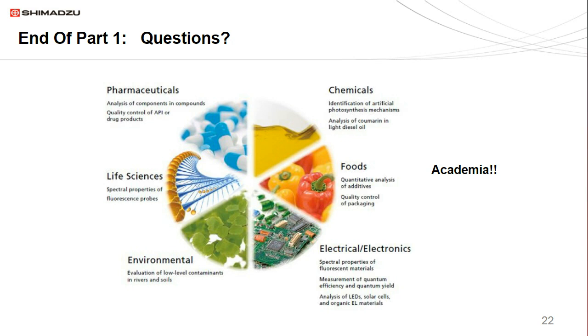On the emission slit, if you open up the emission slit, you essentially collect more light from the sample, so the fluorescence will go up. If you decrease the slit, the fluorescence goes down, so you can actually use it as a volume control to get the number of fluorescence intensity units that you want.